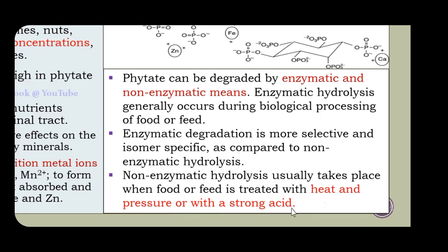So here it is with a strong acid. Again, we use many means to make the food break down, and it is treated in such a way that after consuming, the food is very good and nutritious. This non-enzymatic method is going to break down the phytate.